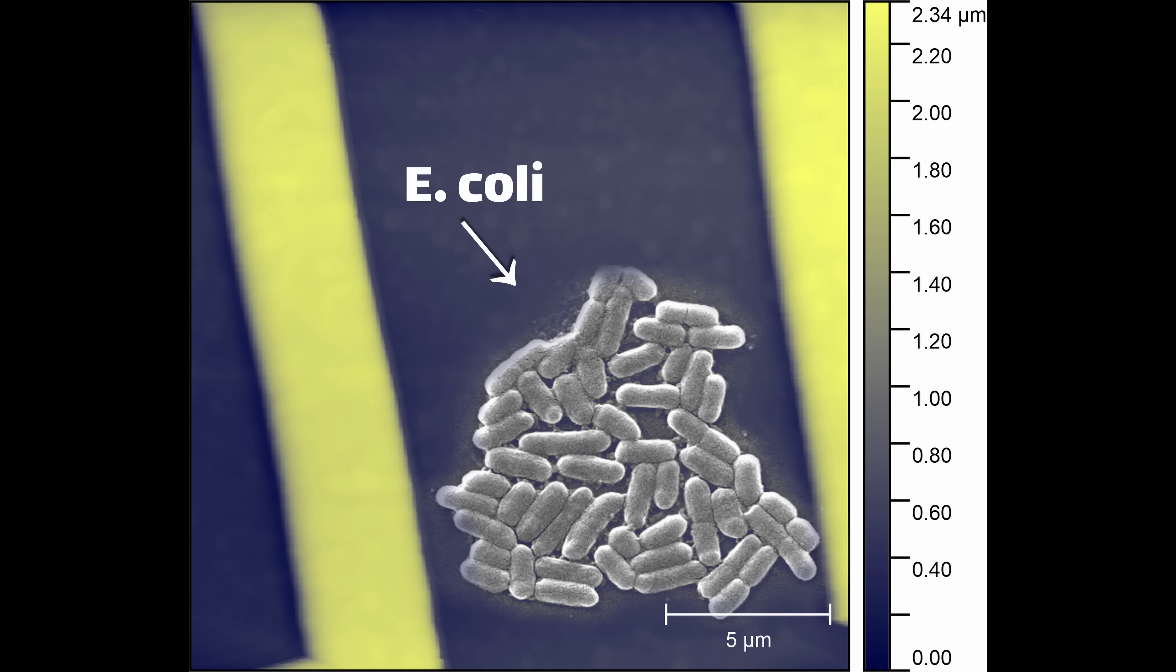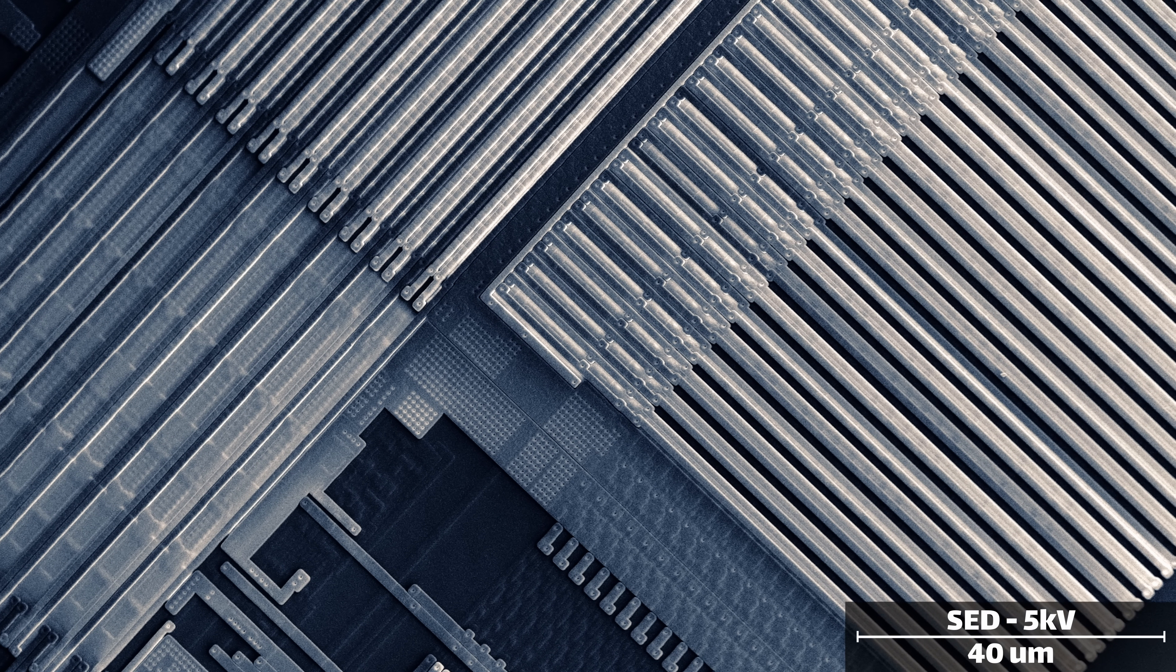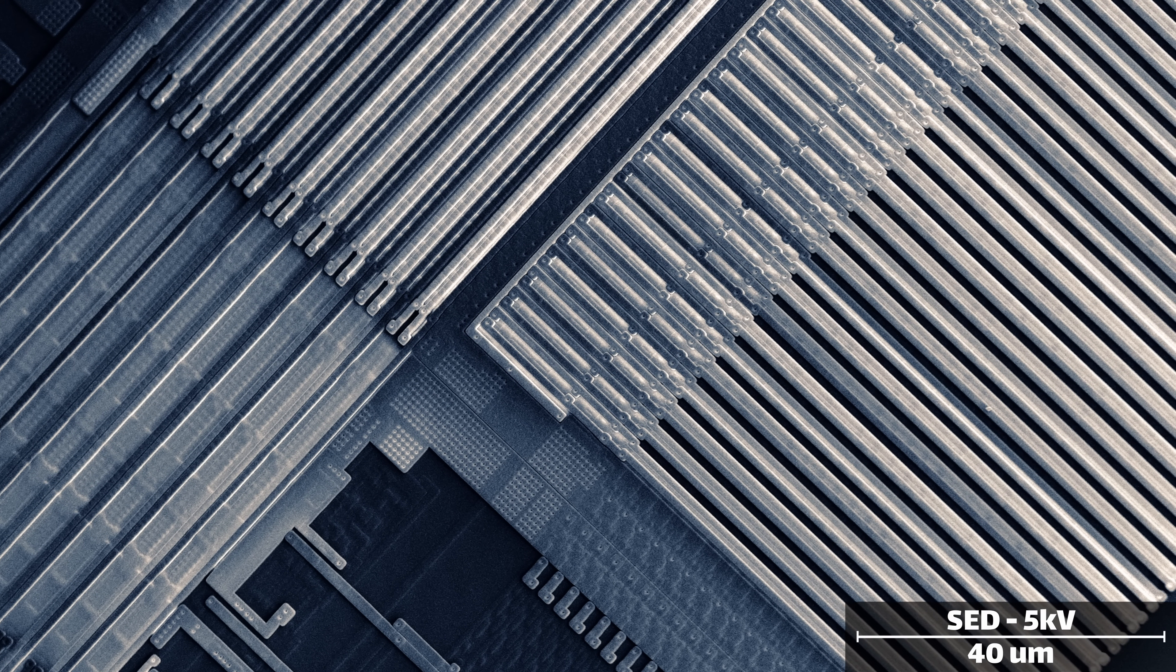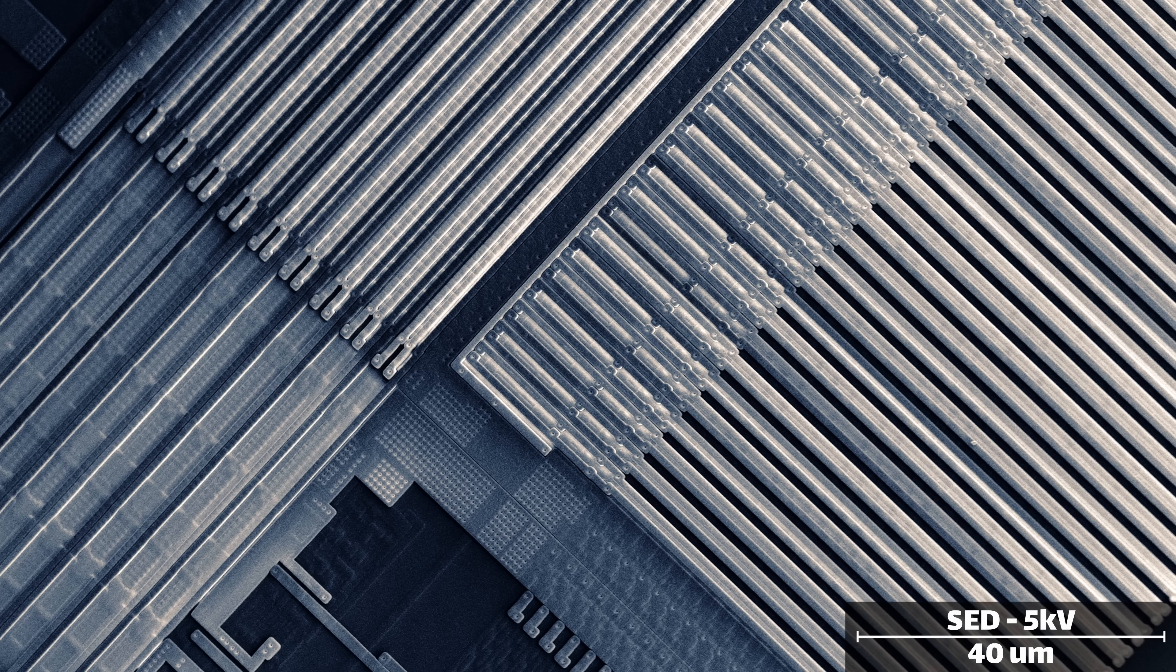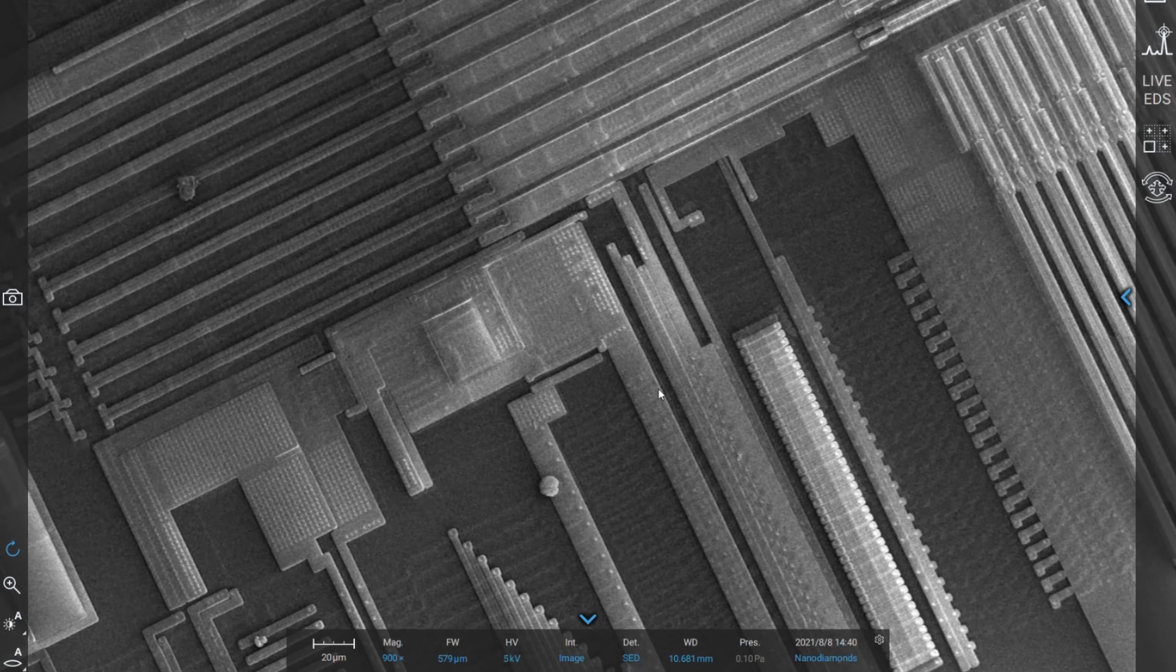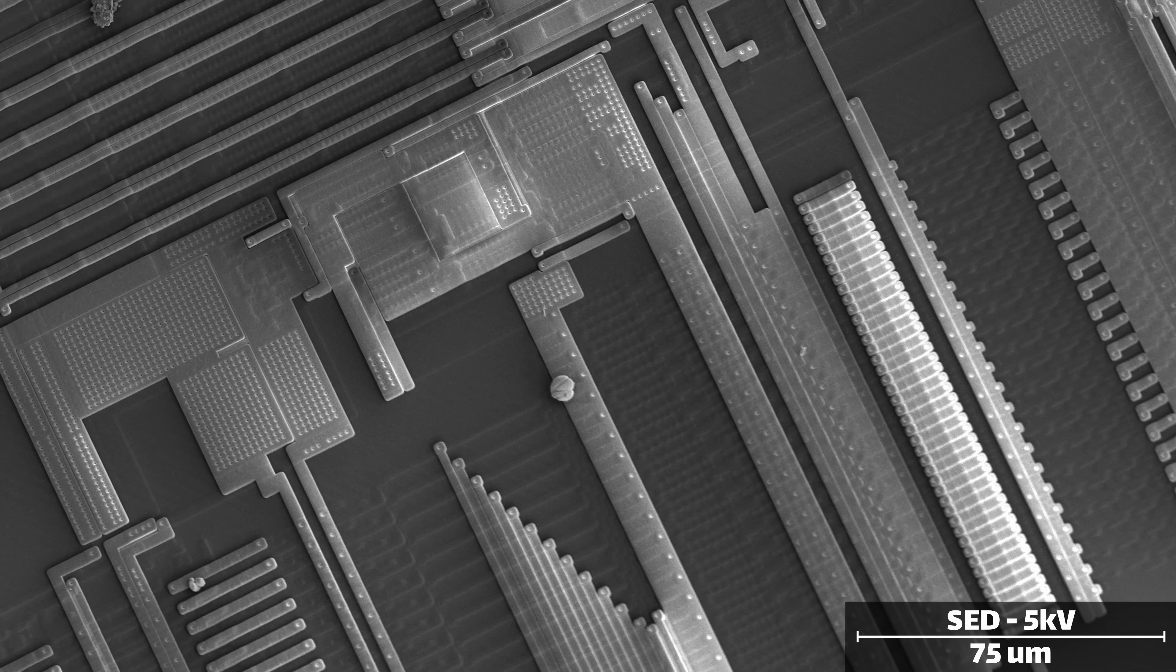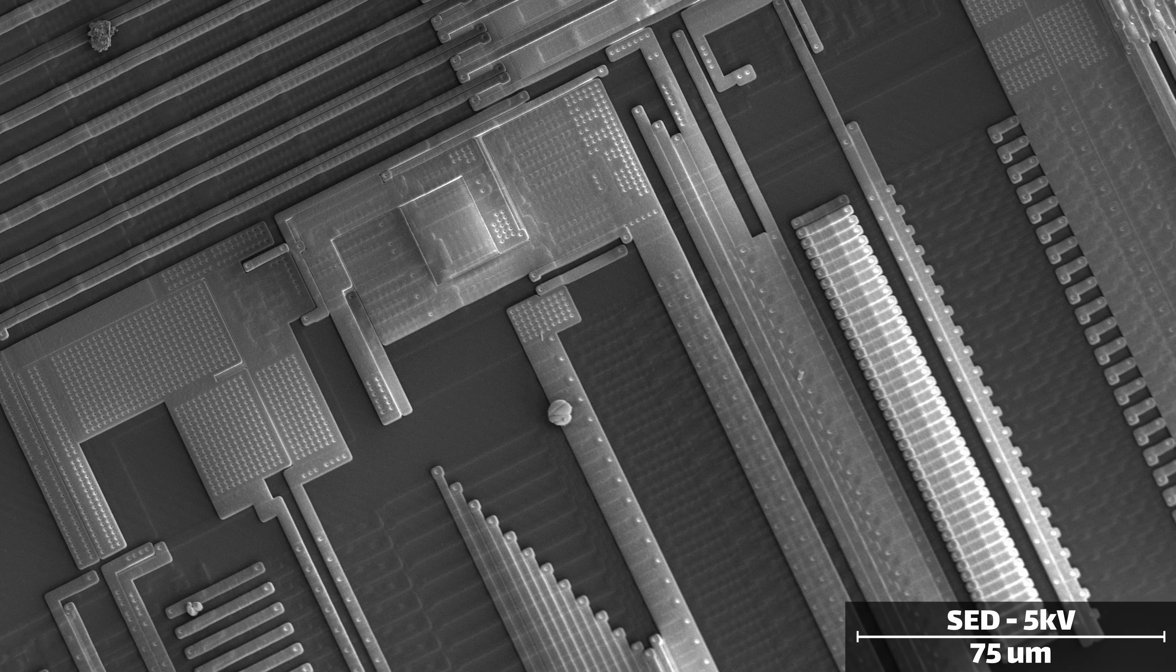Earlier I mentioned that integrated chips are stacked in multiple layers. Moving over to the scanning electron microscope, we can begin to see some of that structure. You might notice that the underlying layers influence those above it. The surface is wavy where one trace passes over the other.